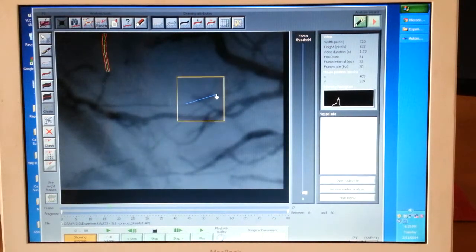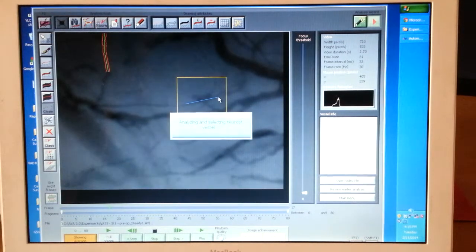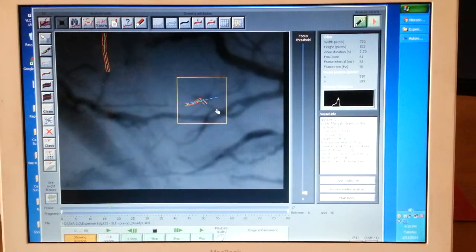So you see this area, there are some vessels that are intersecting. If we want the computer to draw this part out, it gets confused. It draws this, it misses everything else. This is why I'm not a big fan of this, okay? So I prefer to just go with the manual drawing.